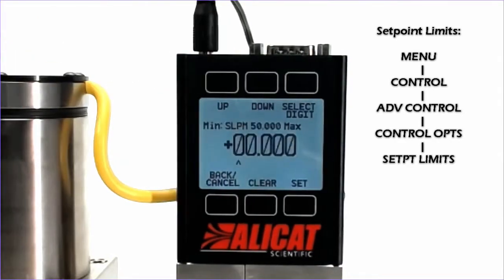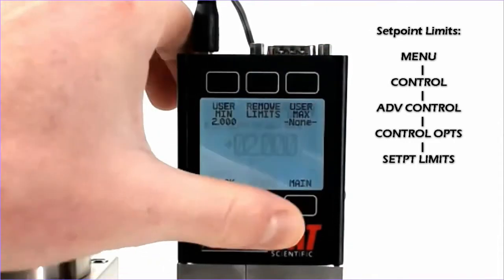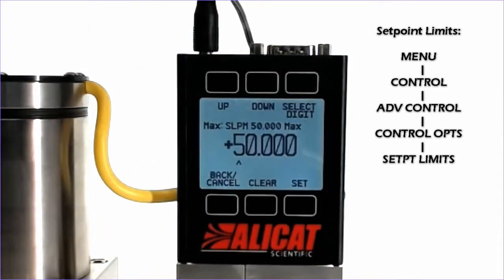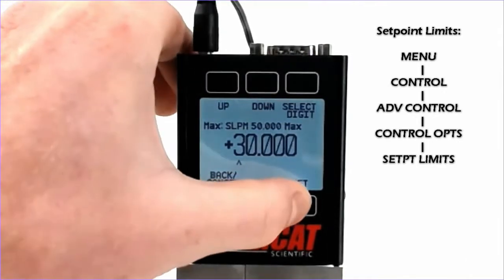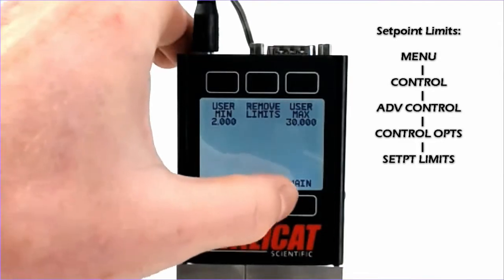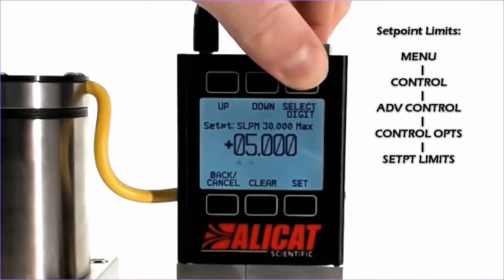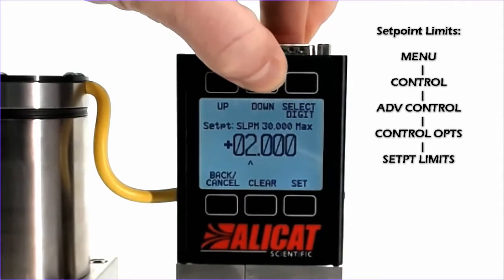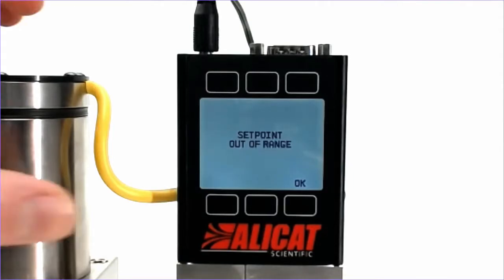So say the minimum we would like to set to 2 SLPM, and the maximum we will set to 30. Now if a set point is given to the device that is outside of this range, the device will not accept the set point and come back with an error. Say we would like to send it 1 SLPM, which is clearly outside of the range — the device will tell us that the set point is out of range.